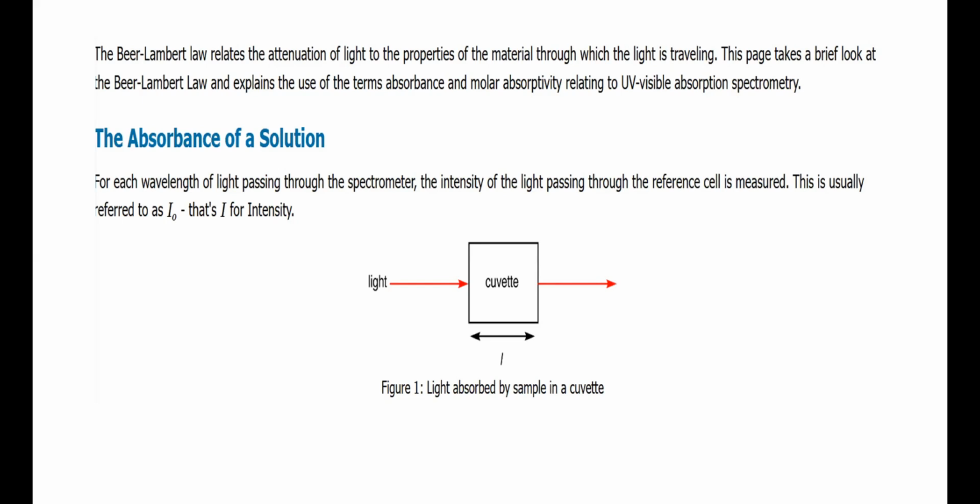In the college, you have used colorimeter. The advanced and more applicable version of colorimeter, if it is to be talked about, it is spectrophotometer. As in colorimeter, you have a light source, then a cuvette. In between these two, you have a slit, a filter to choose, then the cuvette in which you keep the sample, and then the light is allowed to pass through that sample, which is filtered.